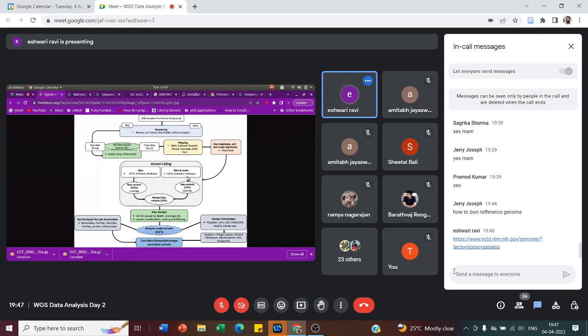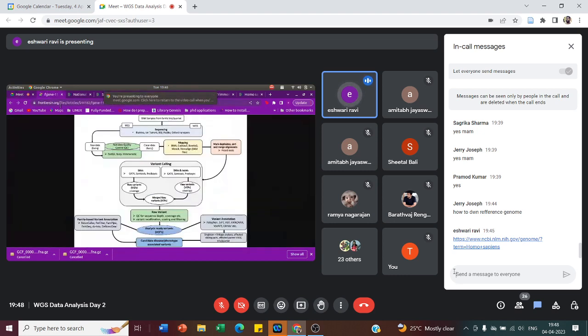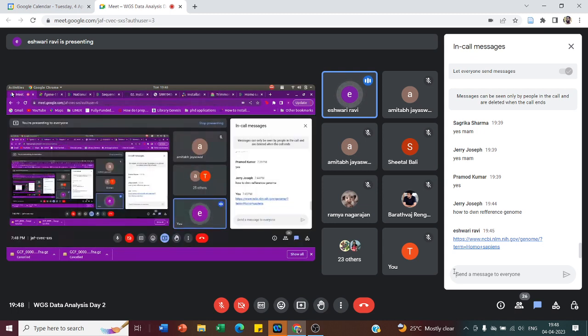And the other part, right from marking duplicates to variant calling, I shall be discussing tomorrow, because I don't want to load the entire data. I will share the link for this paper as well, so you can read it once. The paper describes in detail all the WGS analysis, the types of sequencing approaches used, everything.